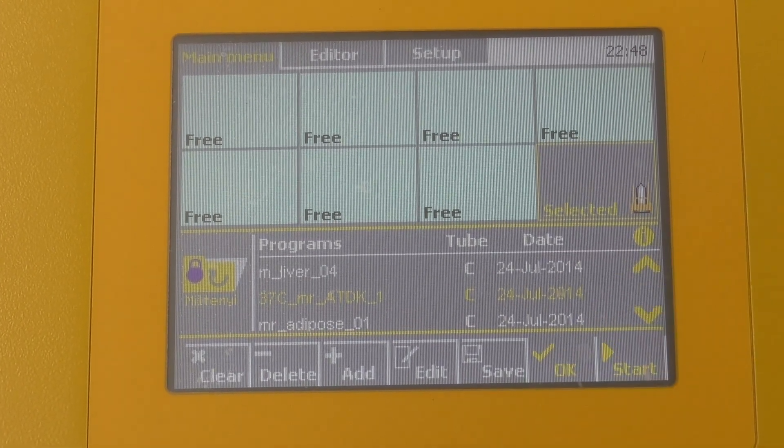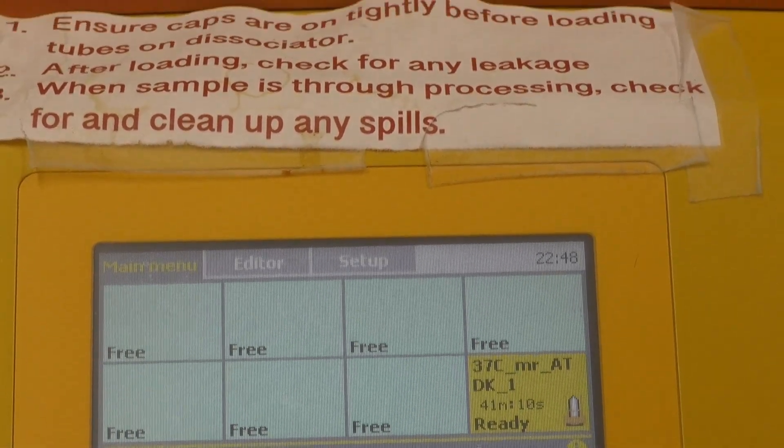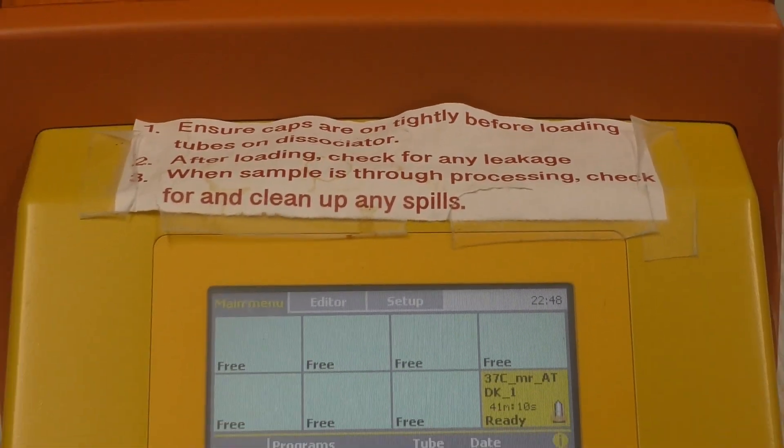Push OK to confirm. It will show as ready. Click Start to start the program.